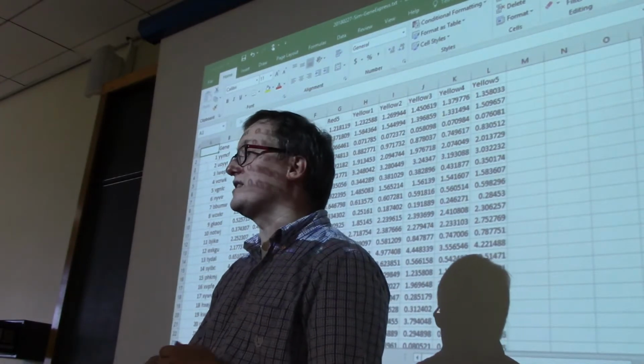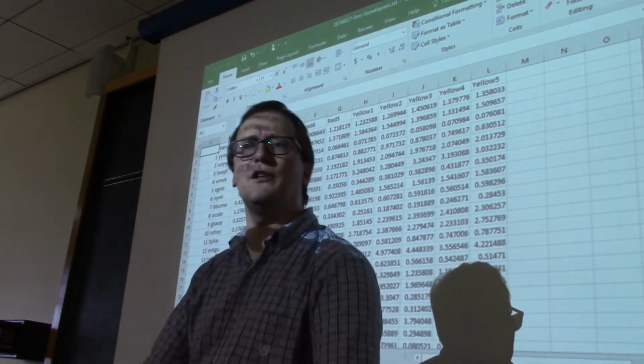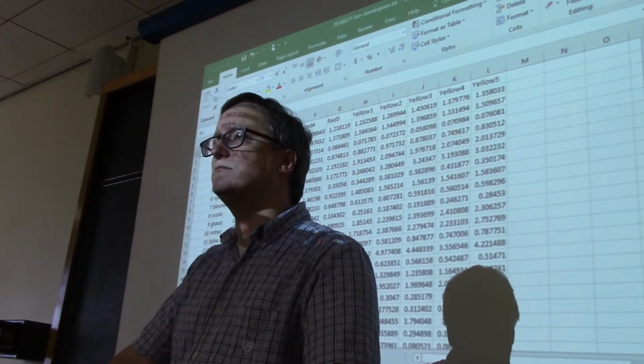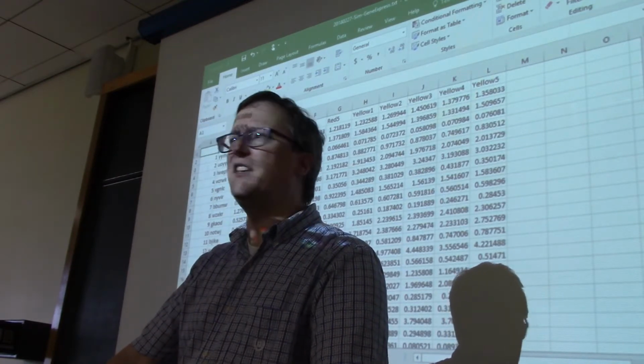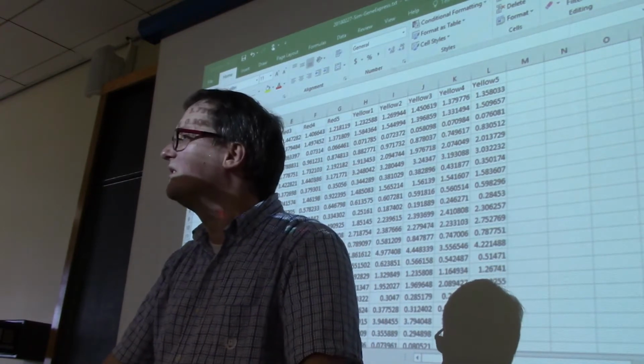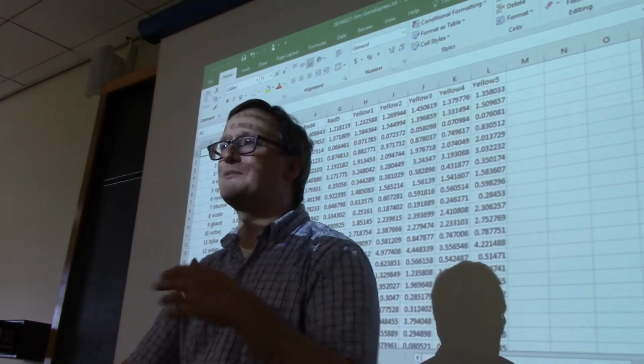However, you can imagine data sets in which a great number of transcripts are measured. How many transcripts are there for the human transcriptome? I think current estimates are somewhere between 70 and 100,000. So with something like that, you really do need to have a fair number of gene names to avoid collisions here.